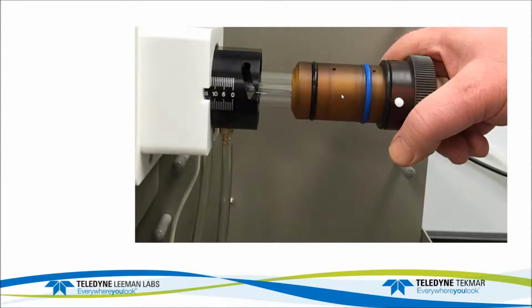Once the torch is located in the system, the gas connections are made. Those O-rings provide the difference between the auxiliary and coolant flows. So replacing the torch and putting the torch in the system is fairly automated.